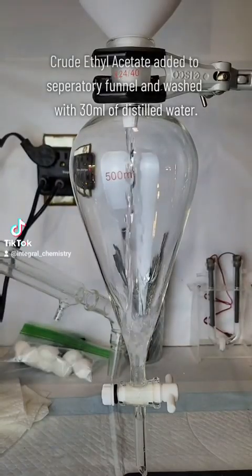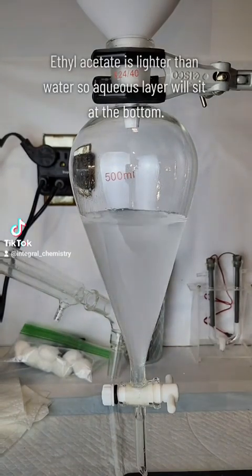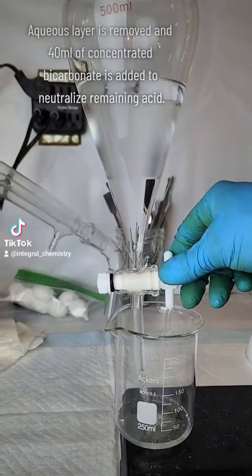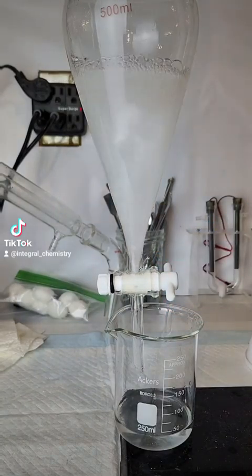Once the distillation is complete, I transfer my crude ethyl acetate to a separatory funnel and begin my thorough washing process. The first step is done with distilled water, which will remove most of the water-soluble impurities. This is followed by two washings with a saturated sodium bicarbonate solution to neutralize any residual acid.